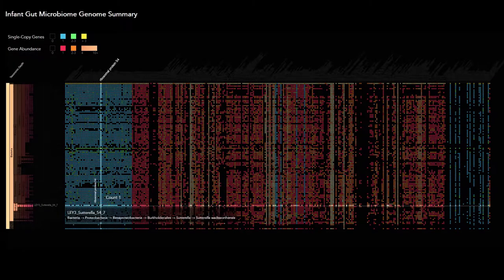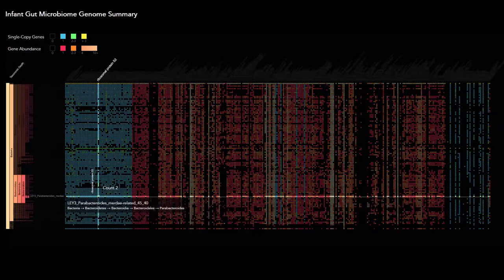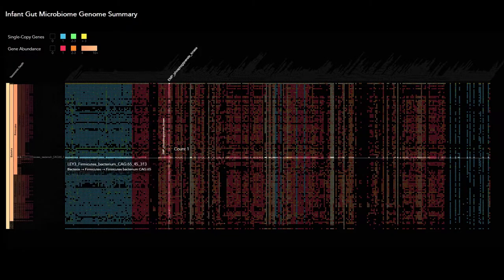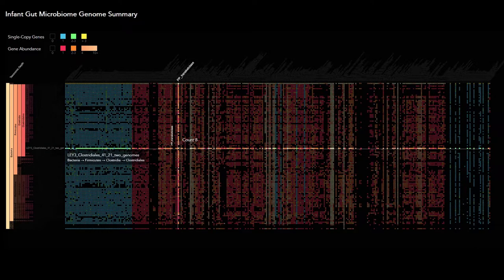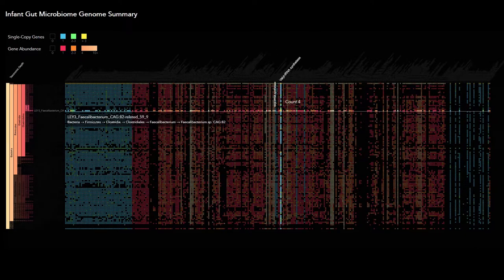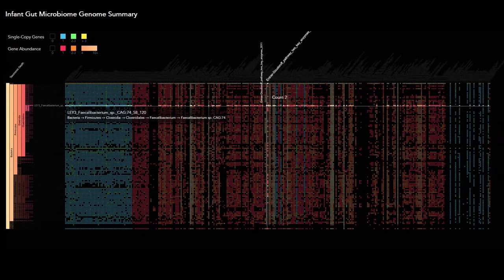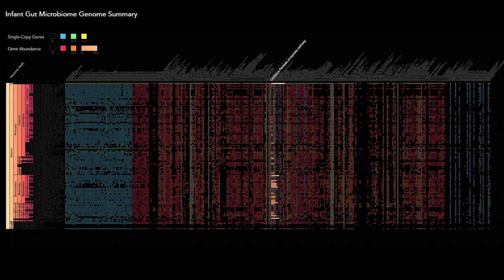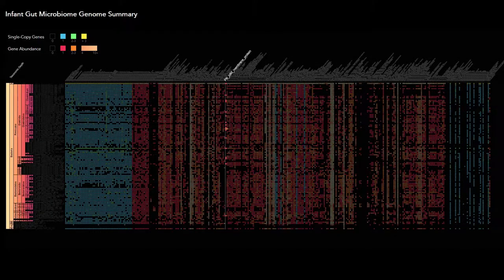A dense interactive chart titled Infant Gut Microbiome Genome Summary is quickly scanned. The user pinpoints data on the color-coded grid by identifying the intersection of the vertical and horizontal axes.